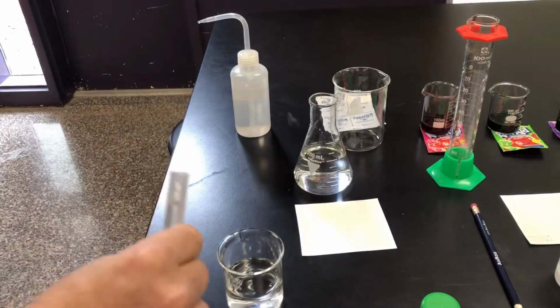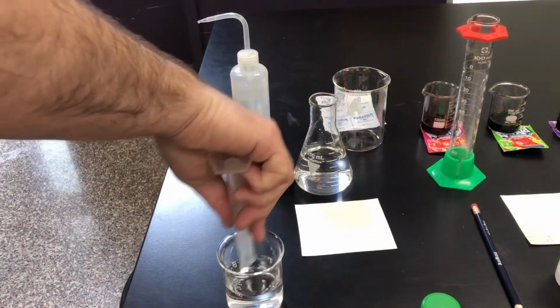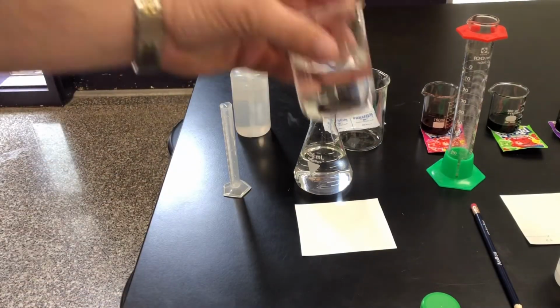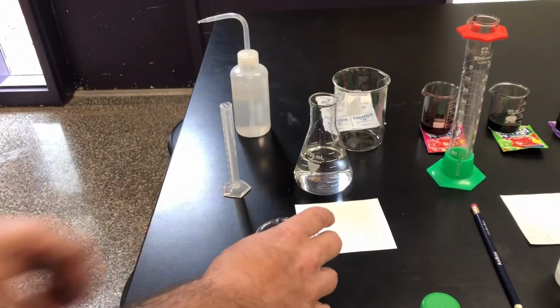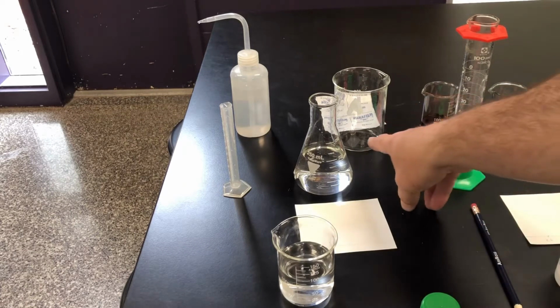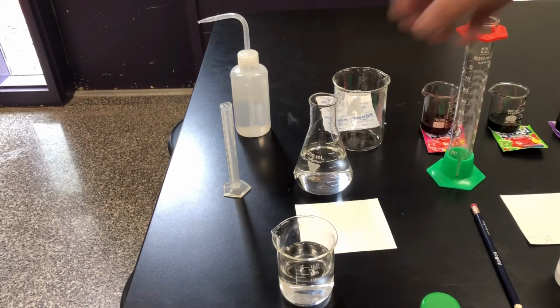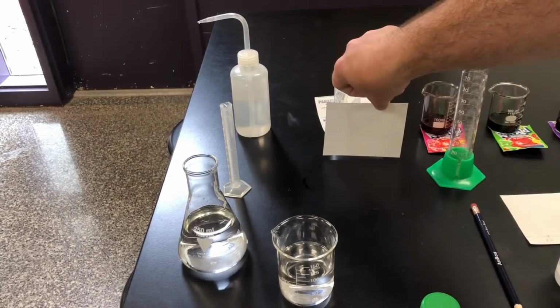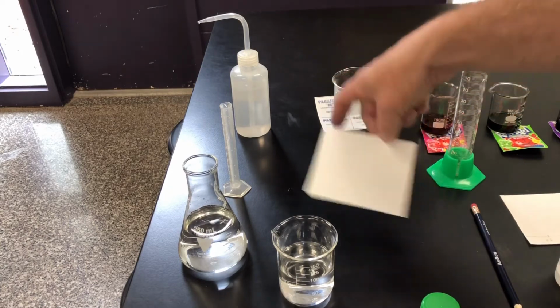Then if I add 10 milliliters of the salt solution to 90 milliliters, and after that has been mixed, I will mix that later, then I have 100 milliliters of 0.1% solution of sodium chloride. Why did I only mix this amount up? I mixed this amount up because I'm only going to use about 25 milliliters in each of these containers as we put it in there. If I put too much in there, it'll go above the line.